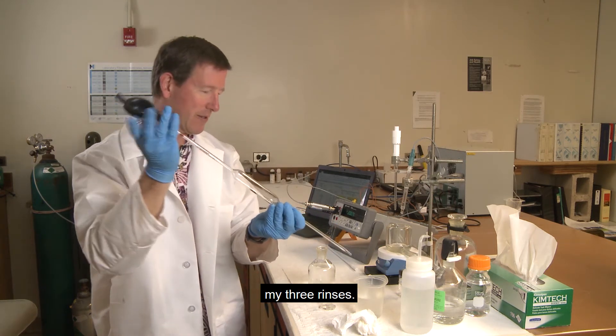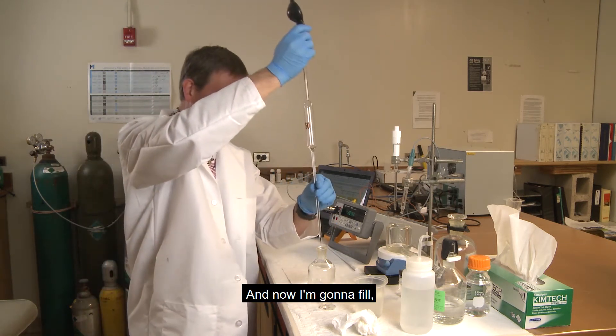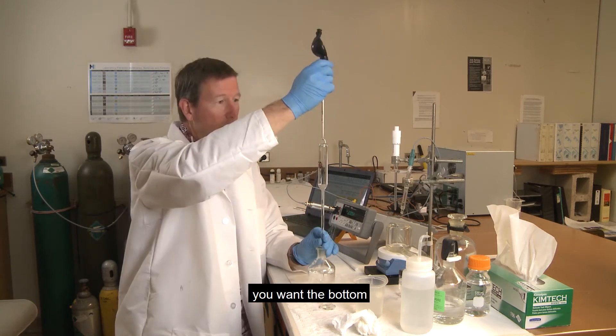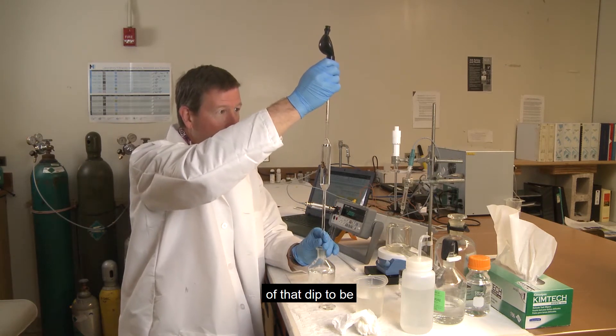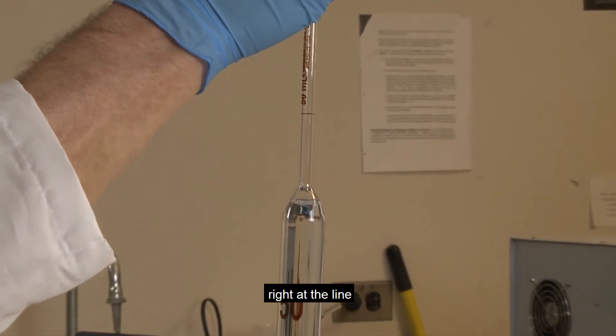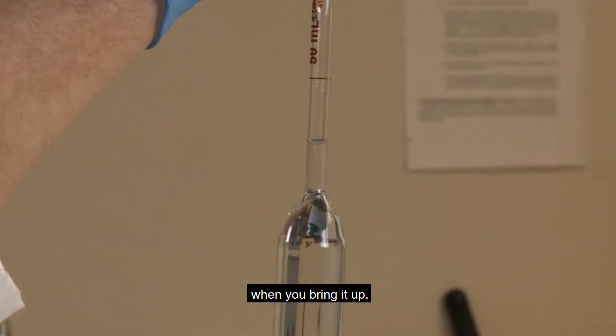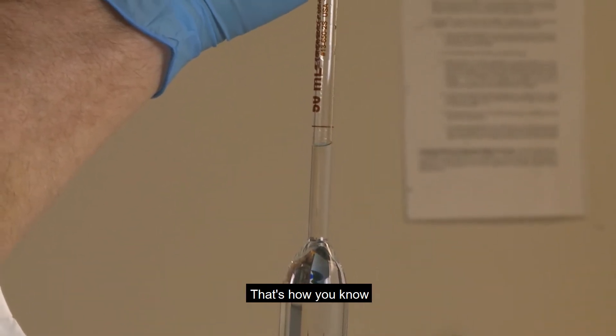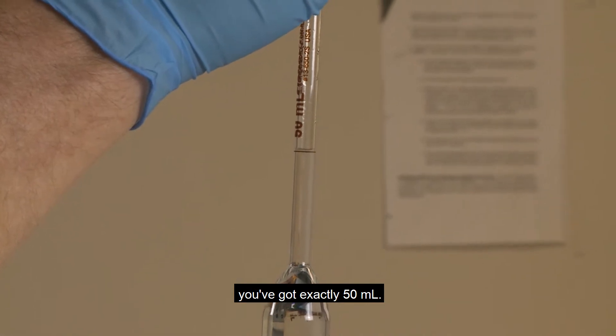So now I've done my three rinses and I'm going to fill. You want the bottom of that dip to be right at the line when you bring it up. That's how you know you've got exactly 50 milliliters.